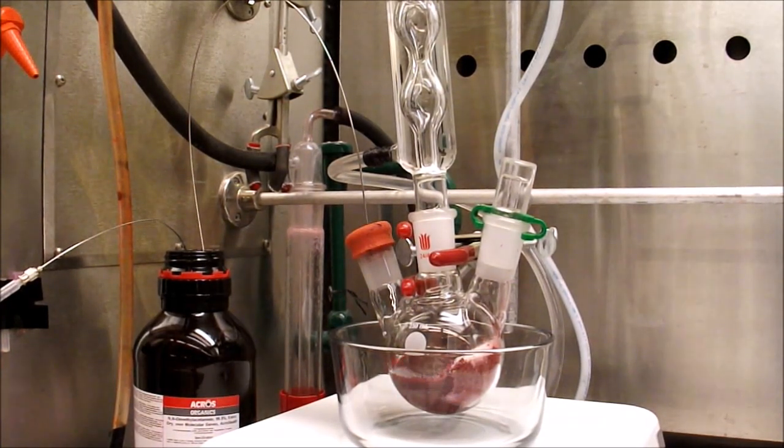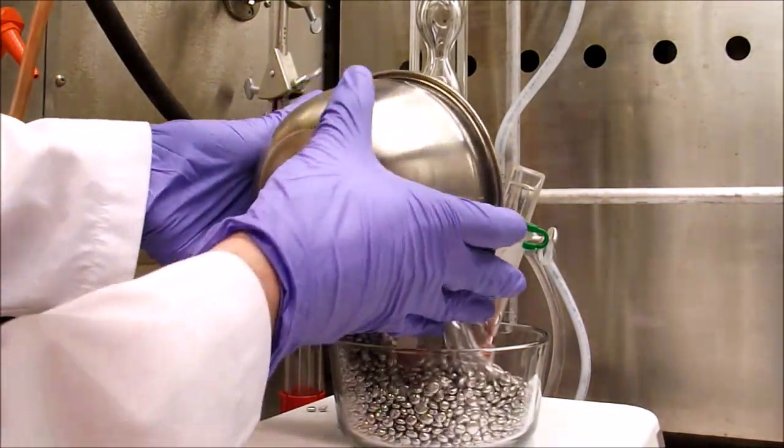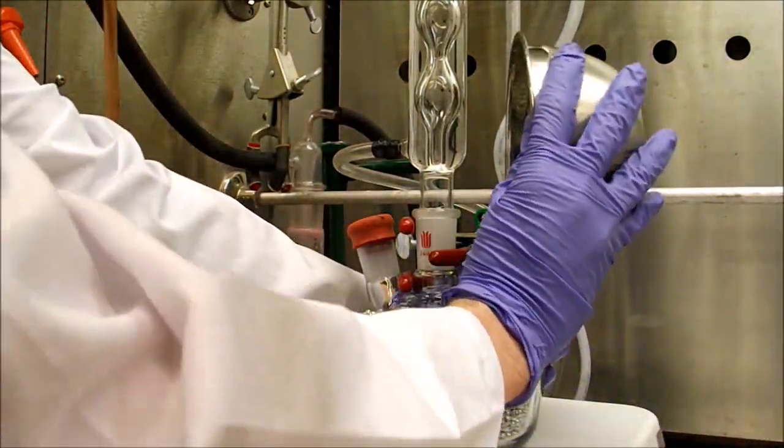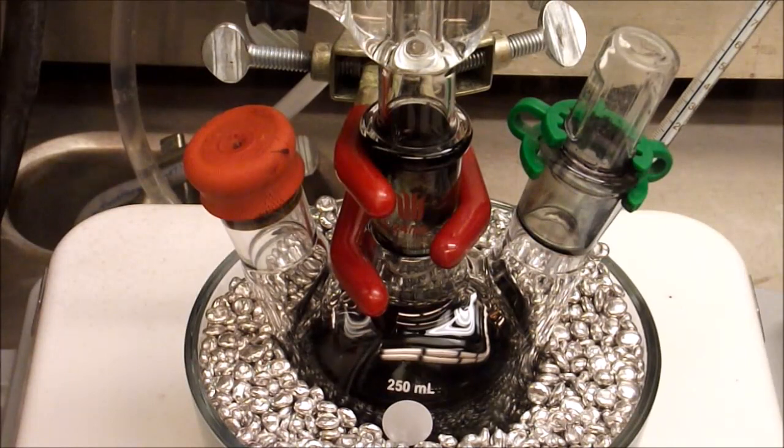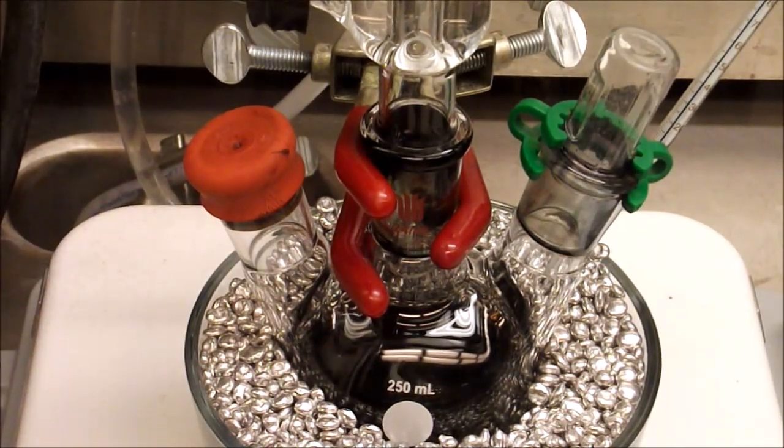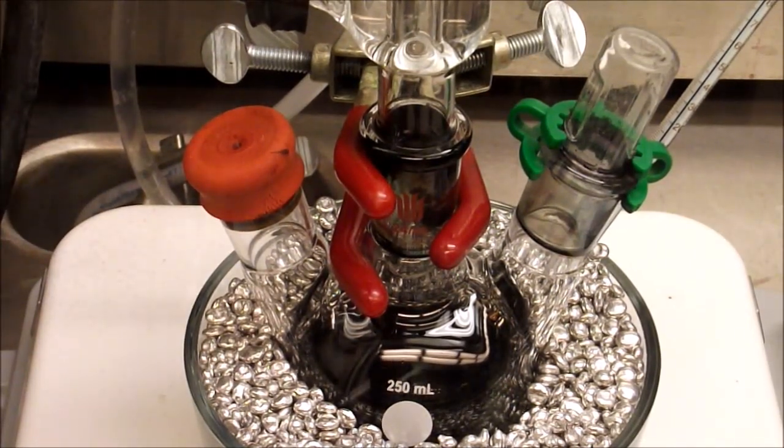Once all the reagents have been added, the reaction is heated to a gentle reflux for 24 hours, during which the reaction turned from red to purple and then back to red. I had some troubles maintaining steady stirring and the reaction splashed a bit which is why there is some material in the joints of the glassware.